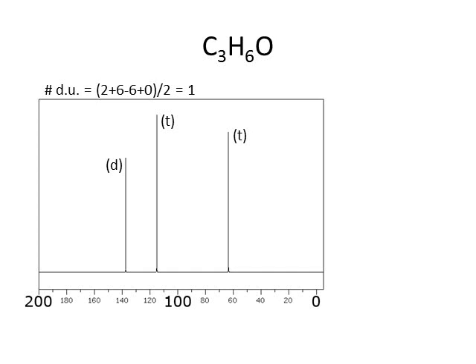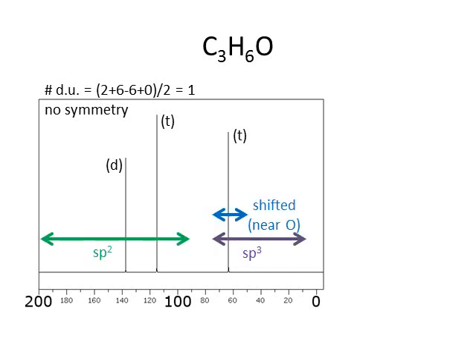Okay, what do I know about the chemical shift? Signals in this region are sp3, and signals in this region are sp2. Seems like we'll probably have a double bond, right? Double bonds involve sp2 hybridized carbons. And in fact, we've got two sp2 hybridized carbons, so it seems like we've got a carbon-carbon double bond.